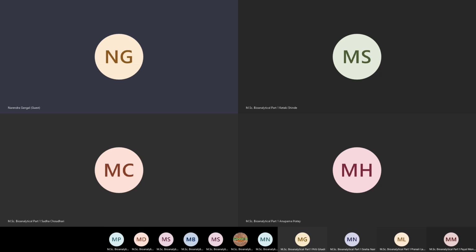Another typical type of technique, which is the most popular today in the chemical industry and in research everywhere, is LC mass or LCMS. Now the ionization sources which are going to be there are going to be different as compared to your GCMS sources. So EI and CI are not used with LCMS. Let us start with the first of our historical sources, some of them, and then we will go to those which are used today.